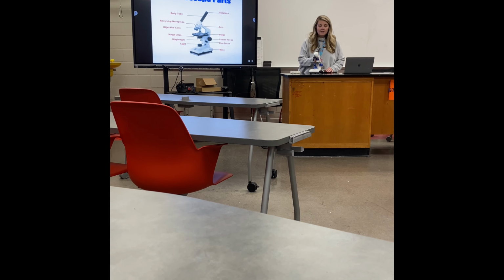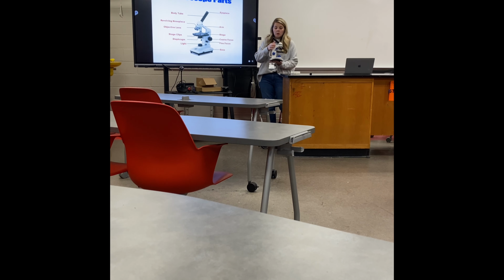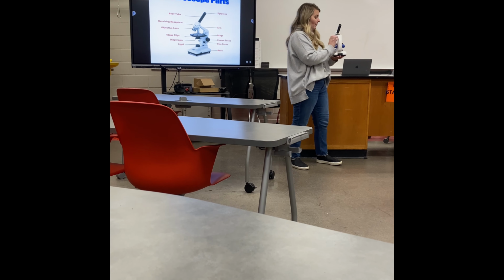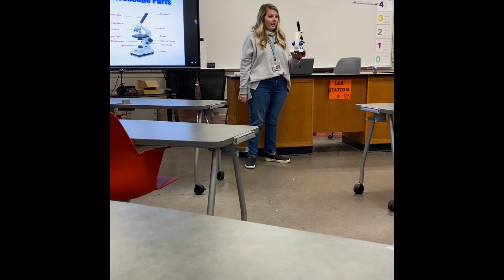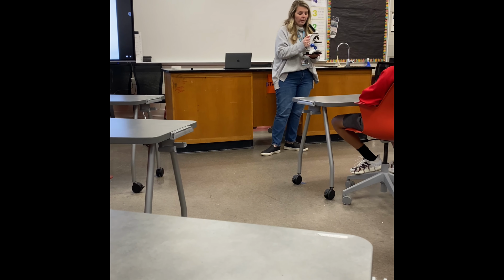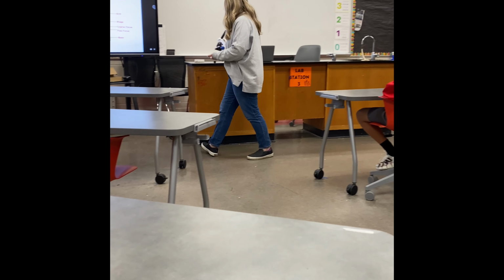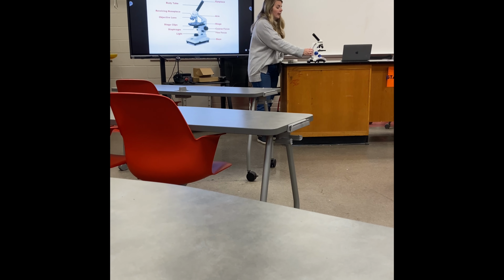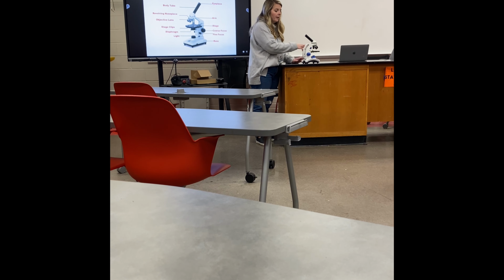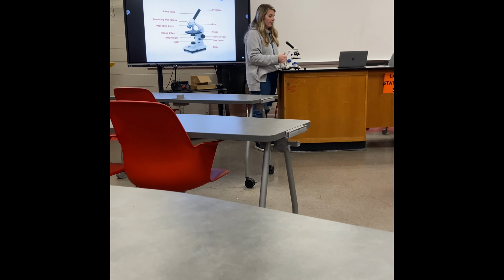A question? Okay, can you please tell me the best way to carry this microscope? Should I grab it up here by the eyepiece? No. Should I grab it by the stage? No, ma'am. Should I hold it with one hand? No, ma'am. No, I should be holding it with two hands, one on the base and one on the arm, correct? Great. And also, if you're moving the microscope on a table, don't slide it because it'll bump it and it'll mess up the stage, okay? So make sure you pick it up and move it instead of dragging it. That's very important.